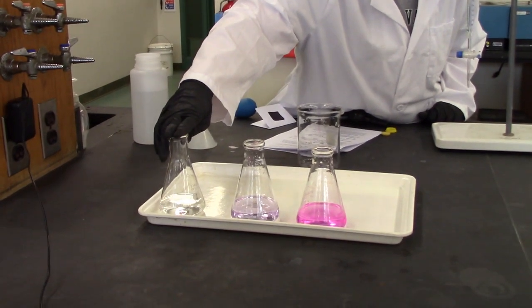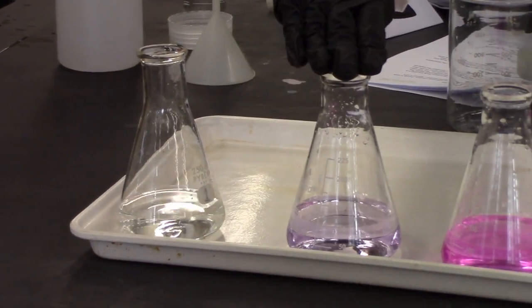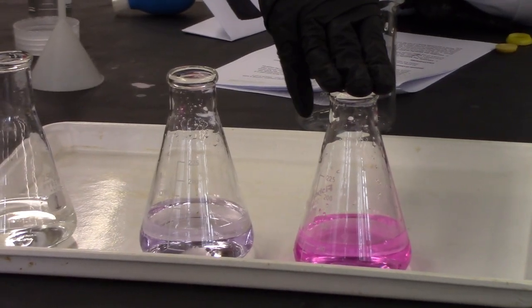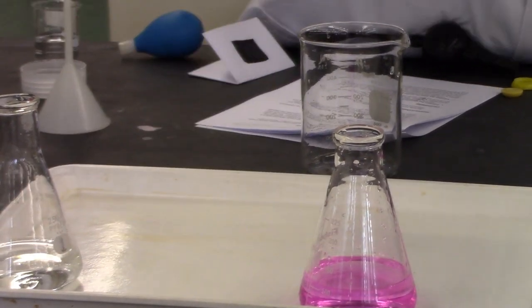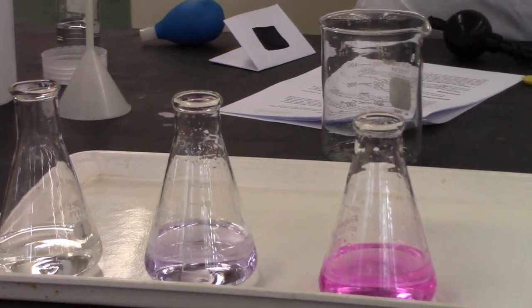I want to show you this compared to where we started, colorless. So this is acidic. This is neutralized, okay? And then here is way too pink, and it can even get pinker than this. You don't want this, this is too far. Okay, you can see this pink is starting to go away already. That might not be quite the equivalence point, but if it persists for 30 seconds, then it is.